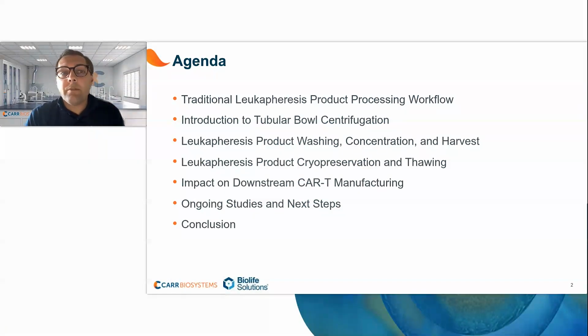So setting the agenda for today's webinar, we'll cover traditional leukapheresis workflow, introducing tubular bowl centrifugation for the leukapheresis workflow and other cell therapy workflows, highlighting data looking at leukapheresis washing, concentration, and harvest. I will then turn it over to Ali Reza to discuss cryopreservation and thawing, as well as the impacts on downstream CAR T manufacturing. We'll wrap up by discussing some ongoing studies for this project, as well as call out some key takeaways from the data collected thus far.